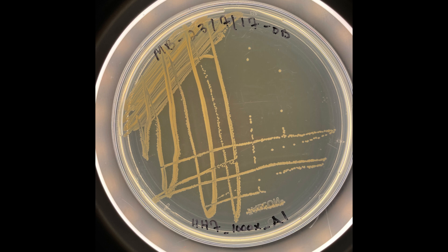The colony morphology all looks really similar, so it looks like the streak was a pretty good streak. If you were to see different colony morphologies or different colors popping out, chances are you're going to have to maybe streak more than three times. This one looks like it's on its way to being a pure culture, but it does need to get picked and restreaked at least two more times.